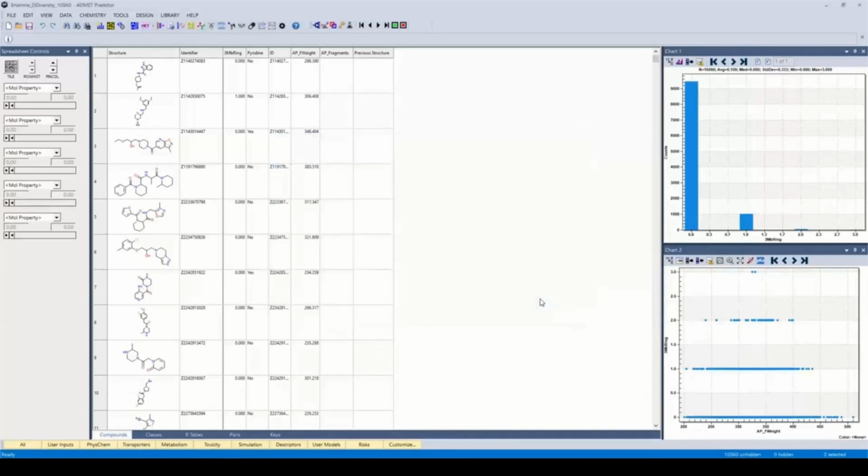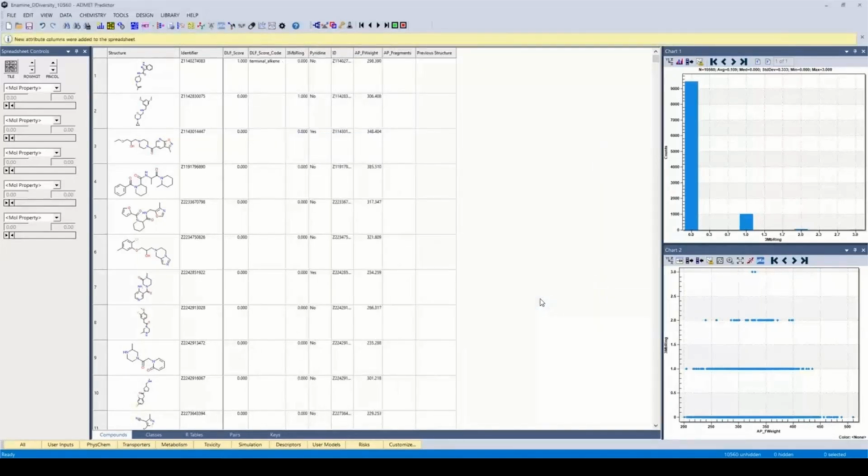And so it actually is a multi-threaded process, which is really quick because we just went through all of these fairly elaborate queries and applied that to our 10,000 structures. So it went pretty quick.